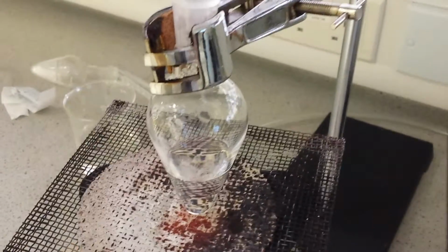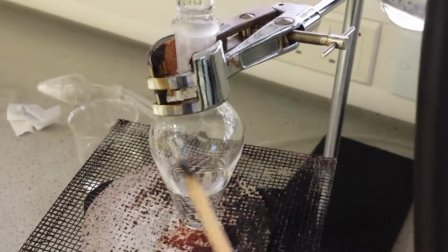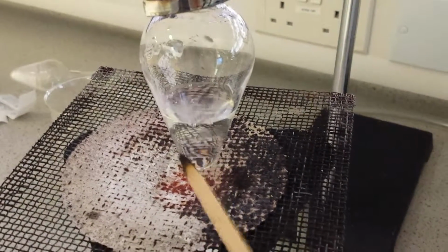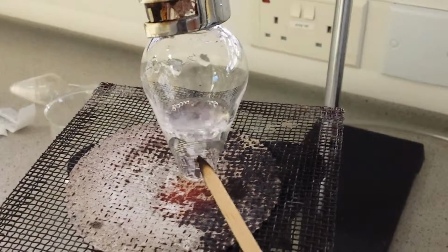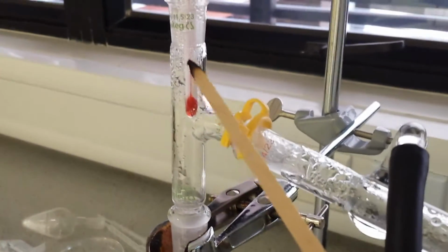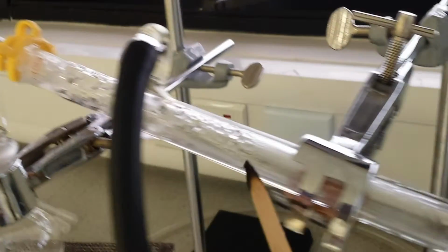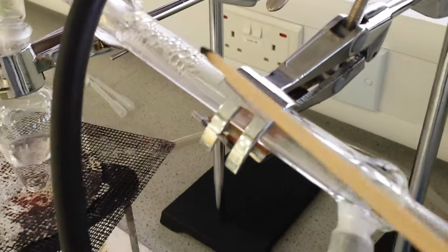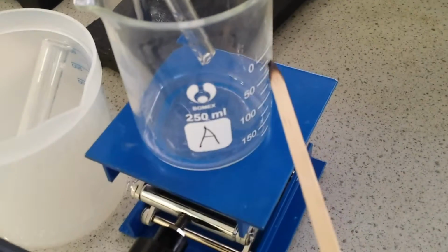So I'm going to pause the video for a while and wait for this to, see, it's starting to boil. Pretty soon you'll be seeing steam coming up the tube and going into the condensing tube where it's going to be cooled by the tap, and the condensed steam is going to turn into liquid water, which will go down this tube into this beaker.